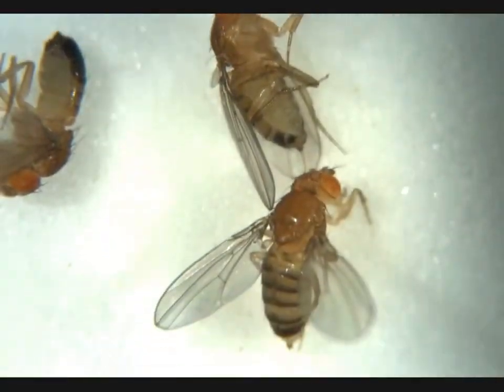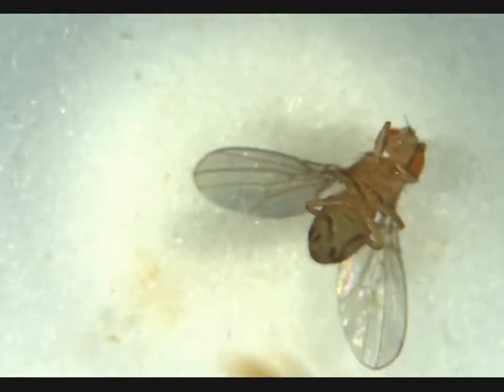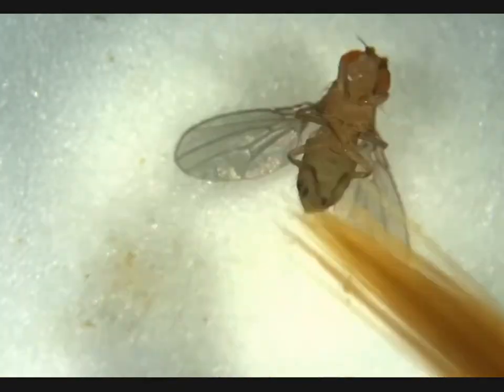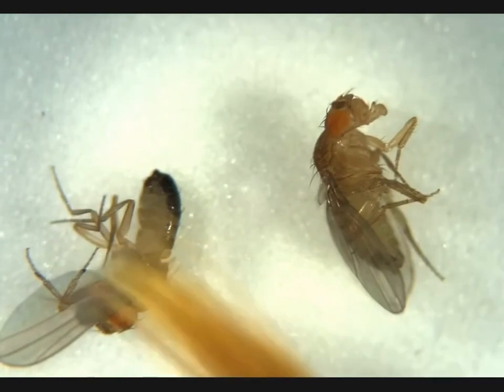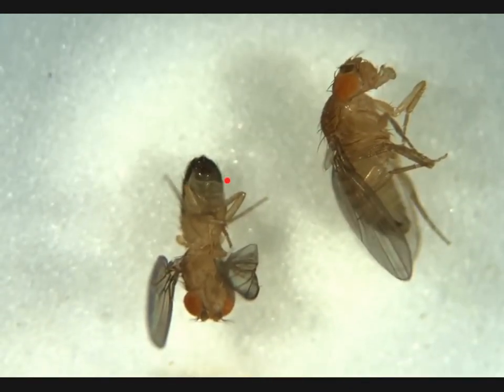Moving on, we see another female here. No penis apparatus, no obvious meconium — adult female. And for our final two flies, we see here no penis apparatus — that's an adult female. And we see an adult male here. Neither of them have obvious meconium. Not what we're looking for.